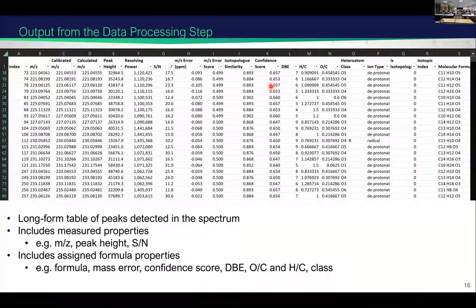So I have kind of a related question, and it may seem dumb, but I'll explain. Why the FTICR MS? In the oceanography world, there are people that do FT, and then there are people that do UPLC tandem mass spec, which is more akin to biological metabolomics. The argument I've heard from those people is that the secondary fragmentation helps them resolve some of those structures. But the trade-off is you don't get as much resolution. You have a decimal difference in resolution, I believe.